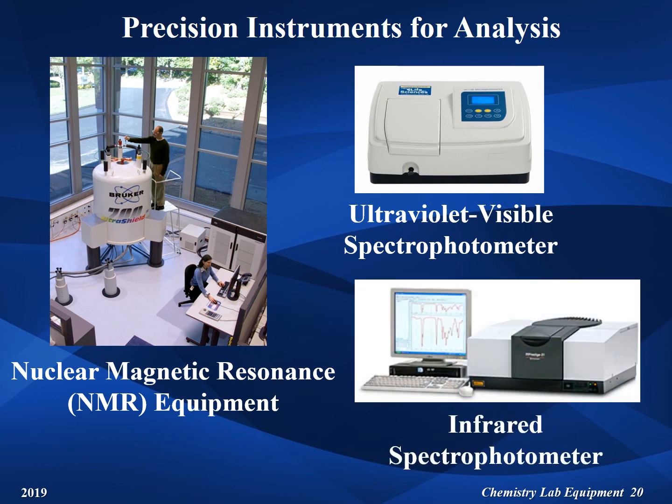When infrared light shines on a compound, certain bonds stretch at specific wavelengths of the light. This infrared spectrophotometer provides a graph that shows the absorption of light at the different wavelengths where the various bonds stretch. For example, a carbon-nitrogen bond will stretch at a different wavelength than a carbon-oxygen bond. The spectrograph can then be used to provide important information on the compound's structure.